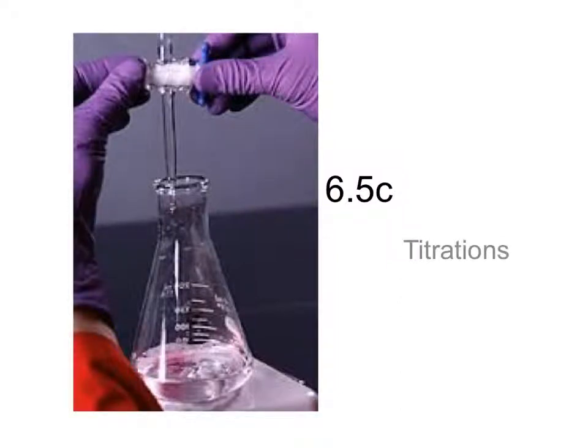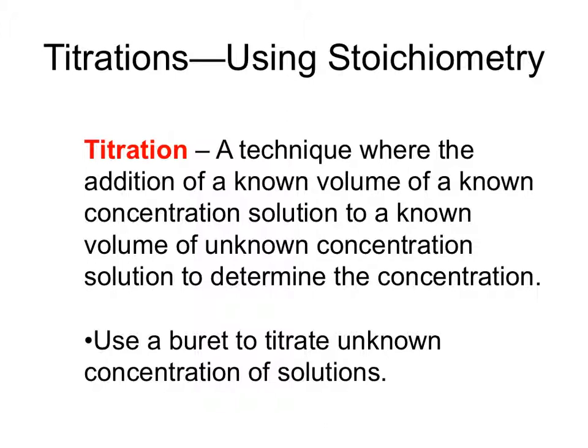The last section of 6.5 deals with titrations. We will merge the concept of stoichiometry and acids and bases together. A titration is a technique where we can determine the unknown concentration of a solution by adding a known volume of a known concentration to a known volume of an unknown concentration solution. In this technique, you will use a special type of glassware called a burette to titrate the unknown concentration of solution.